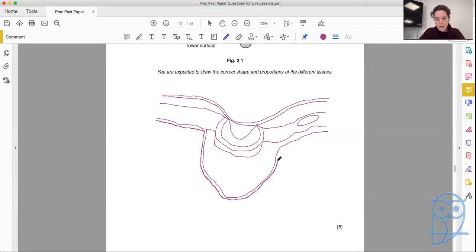So very thin line all the way around. Okay, so it's not the J1 that's in the question, but it's a good practice for drawing a plan diagram. And we can still do the practice of the labeling. They want one line, one vascular bundle.